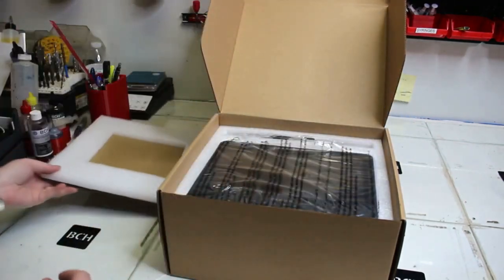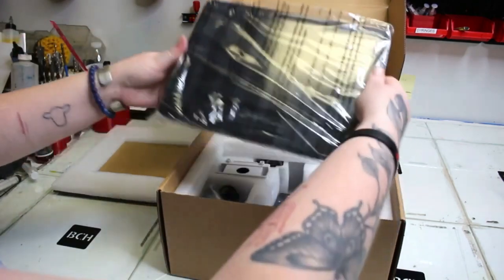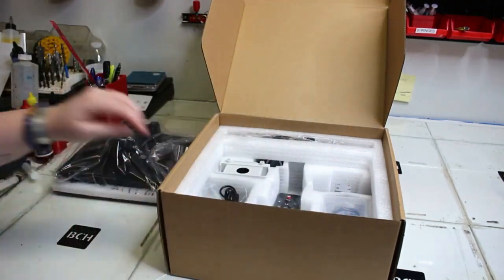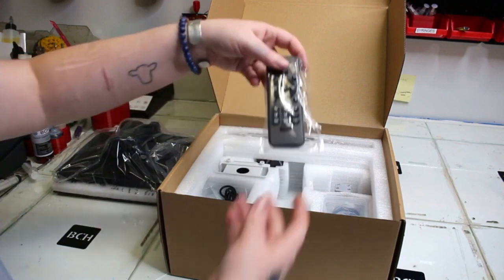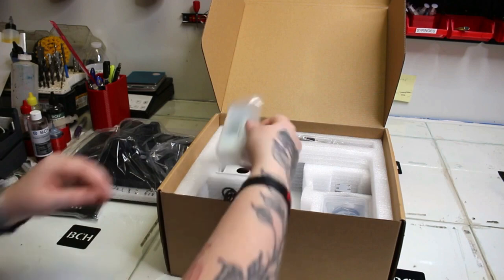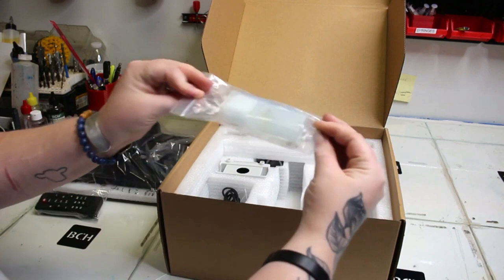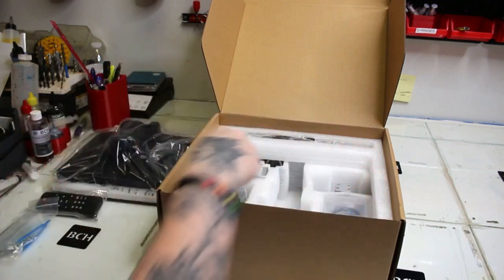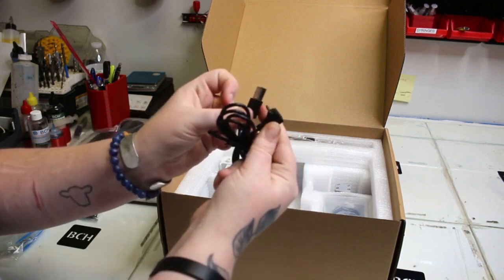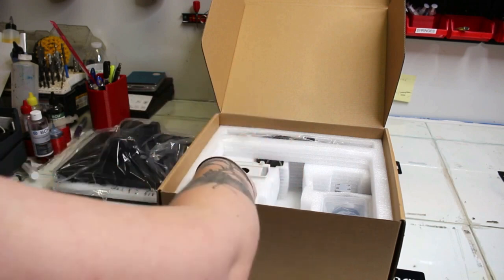I'm unboxing and putting together Link Micro's LM249MS Digital Microscope — their 10 inch HDMI microscope. It comes with three lenses and this one has been upgraded with their 13 inch boom arm metal stand. I'm unboxing everything and it comes with a pair of tweezers and a few science slides that you can look at, and we'll look at them with the third lens.